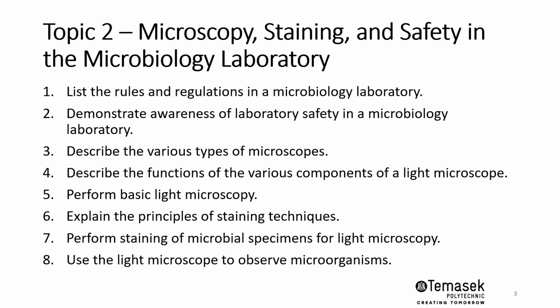I'm showing the intended learning outcomes for topic 2. You're expected to list the rules and regulations while working in the microbiology lab, and demonstrate awareness of lab safety while working in the lab. You'll describe the various types of microscopes, we'll look into that later, as well as the function of the various components of a light microscope. You'll be asked to explain the principles of staining techniques, and as well as to perform some of the techniques during the practicals.